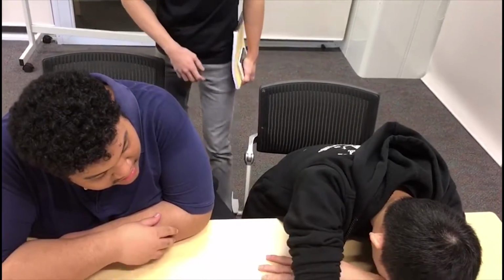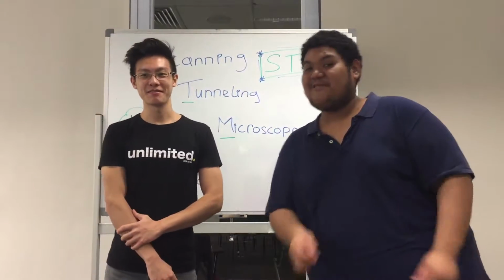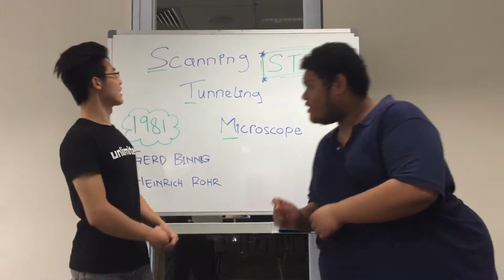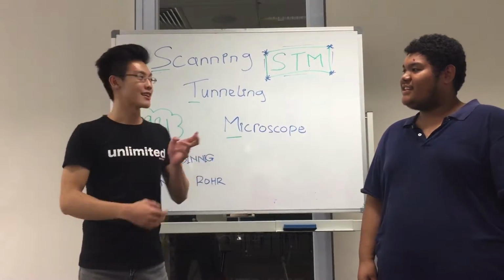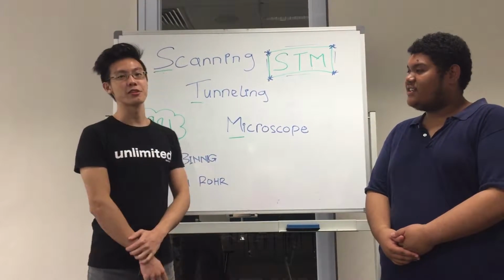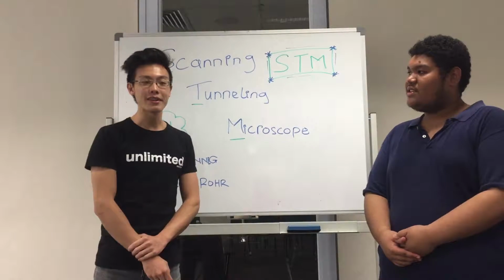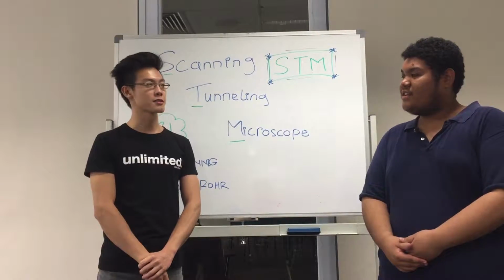Oh, I see. Hi, I'm Taj. And I'm Yin. And today we're going to be talking about STM. Yin, what does STM stand for? As you can see, STM stands for Scanning Tunneling Microscope. STM allows us to view the topology as well as the surface of materials at nanoscale. It can view details as small as 0.1 nanometers by 0.1 nanometers and as deep as 0.01 nanometers.